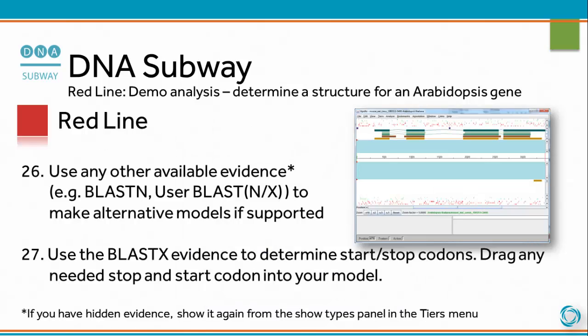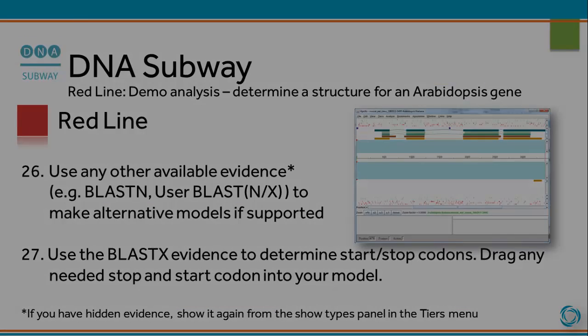Use any other available evidence — for example BLASTN, USERBLASTN, or USERBLASTX — to make alternative models if supported. Use the BLASTX evidence to determine start and stop codons. Drag any needed stop and start codon into your model.